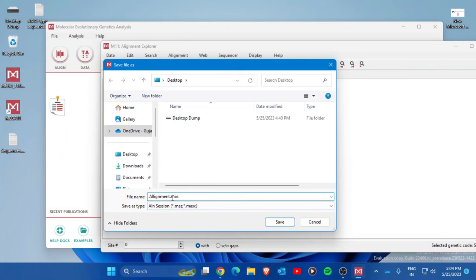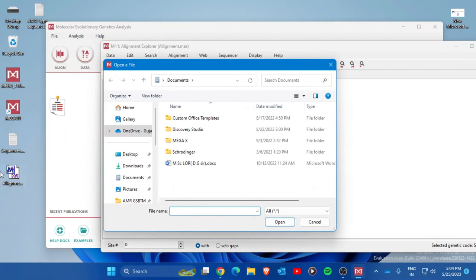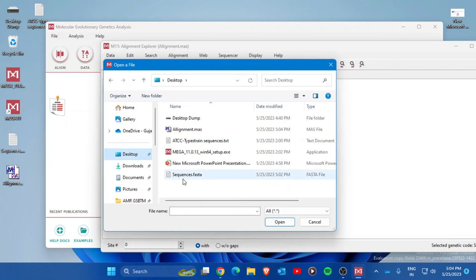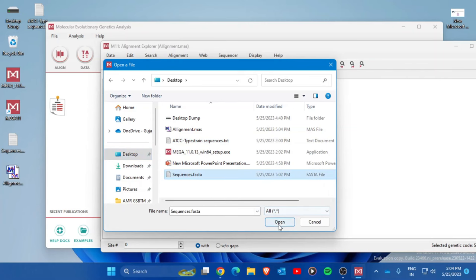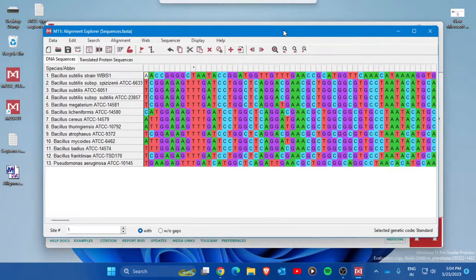The alignment file will open. To import sequences into it, navigate to the desktop where your FASTA file is located. Select the file with the .fasta extension and press Open. All the sequences will now appear in the alignment window.